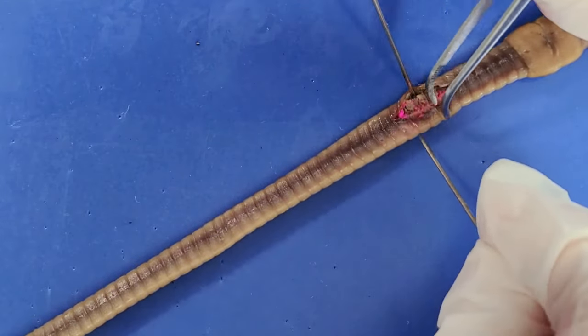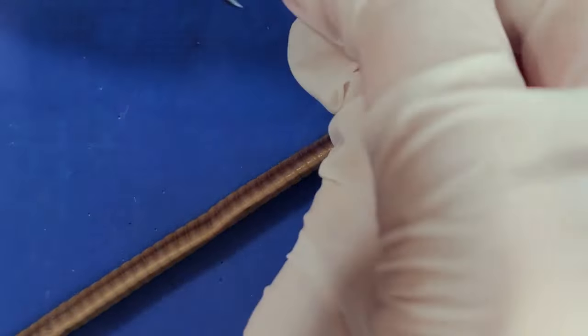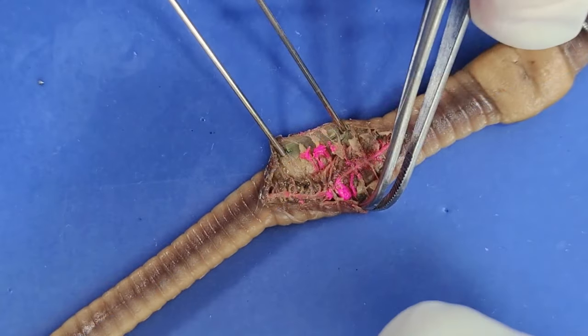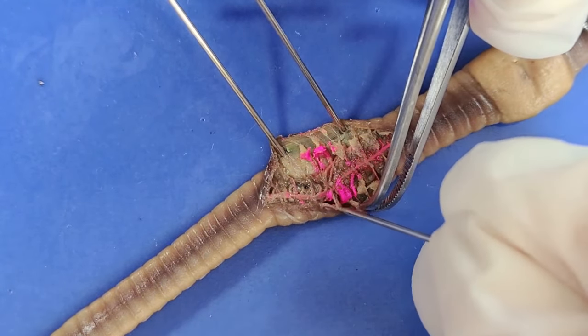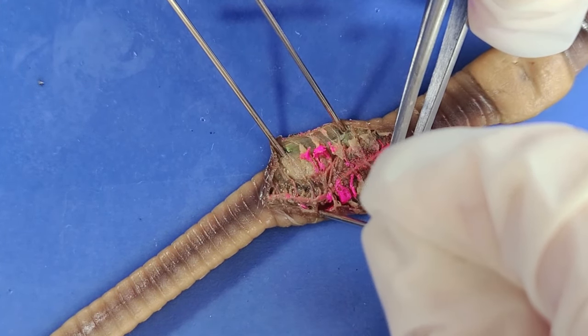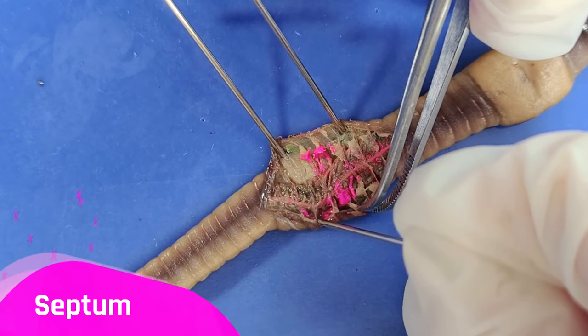So once you make the incision, lift away the skin with forceps and pin it back at around a 30 degree angle. As I peel away the skin, you can see these flaps attached to the skin that divide the worm into segments or annuli. These flaps are called the septum.